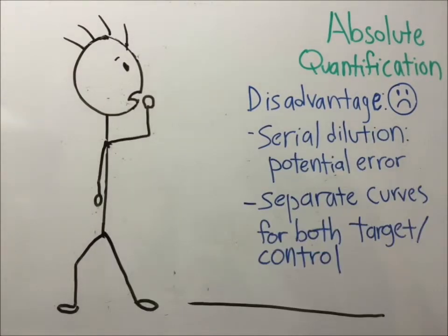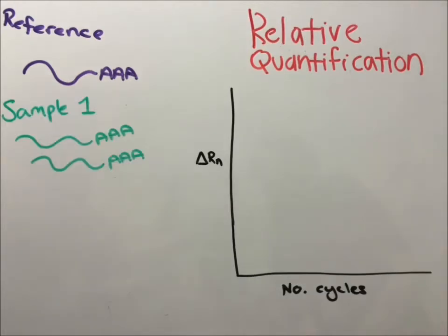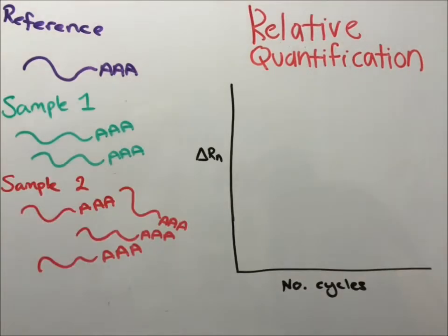Using this method, Tom could also analyze the rate of gene expression by first reverse transcribing an RNA sample into cDNA, amplifying it with qPCR and plotting the fluorescence on a standard curve as before. Relative quantification can be used to quantify the difference in expression levels of 2 or more transcripts.